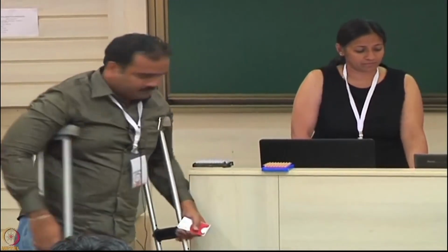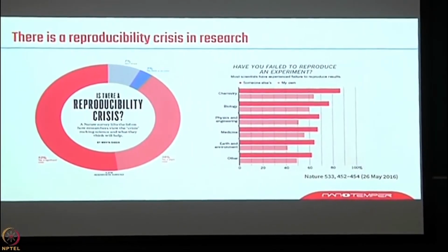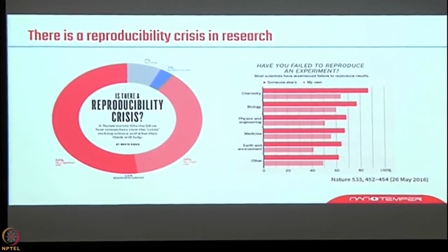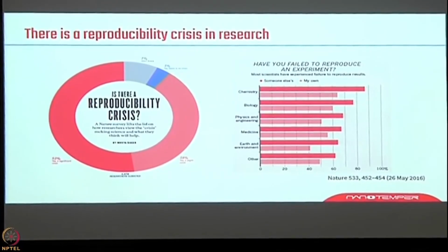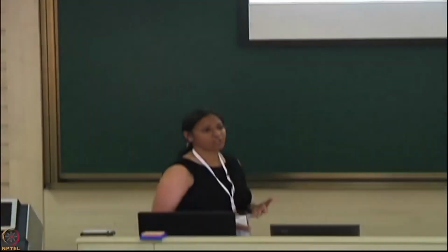Saji, please go ahead. Have you ever asked yourself whether the protein you are purifying is pure or not, and whether it can be used for your future assay experiments or not? That's a very big question that always comes to the mind of any researcher. Before going for any assay, you run a column, you do an SDS-PAGE, or you do spectrophotometric analysis.